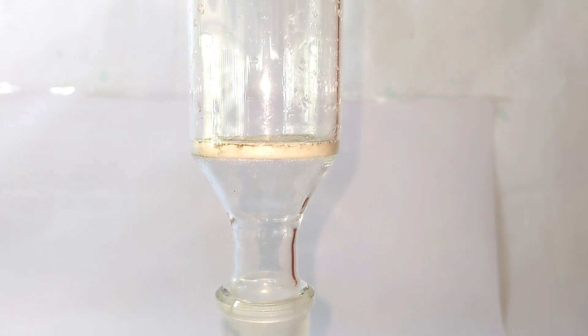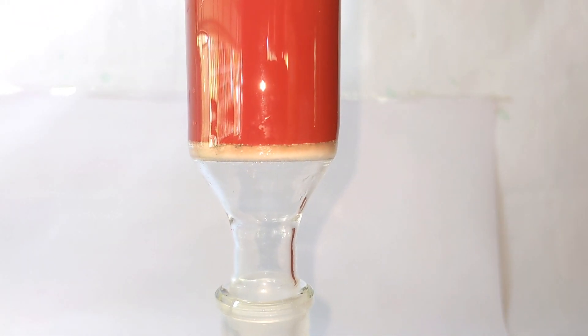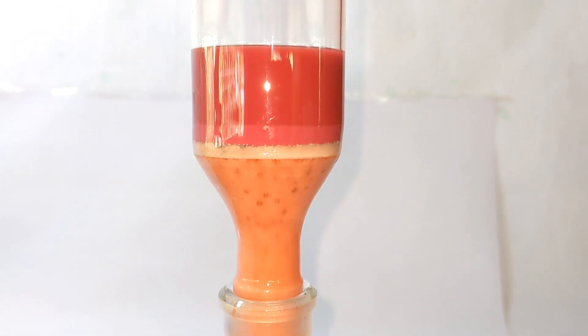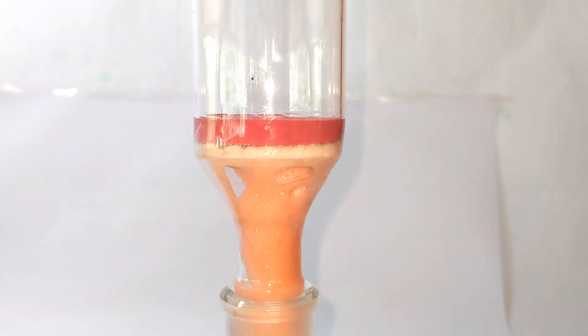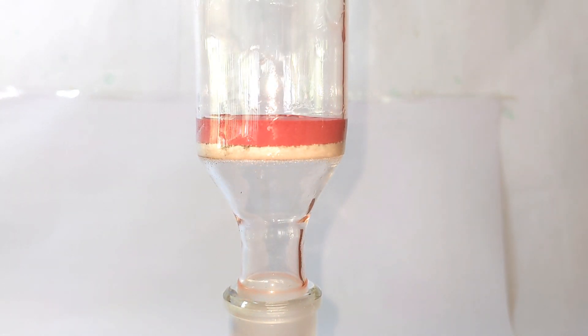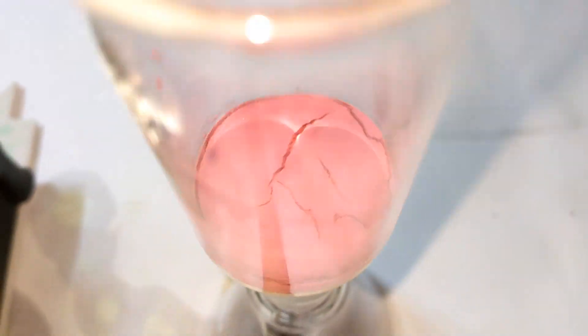The precipitate was then filtered. I used a vacuum filtration setup for easy filtration. The vacuum was kept turned on so that all the water from the product will be sucked inside and the product will be dried.